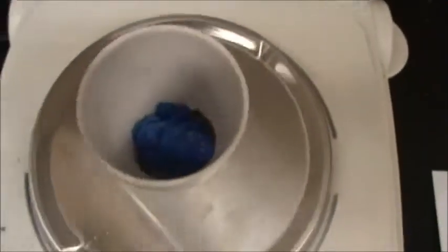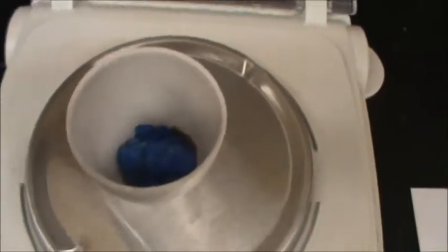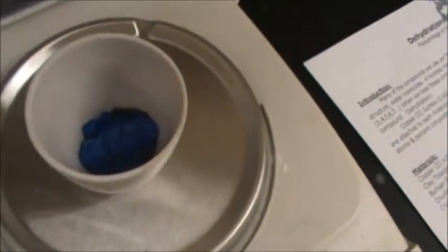Now let's continue on with the observation. Okay, I'm going to make some observations here, just like so. Oops, I'm touching the crucible like I'm not supposed to. Alrighty, so I go and make my observation of the copper 2 sulfate before I heat it.